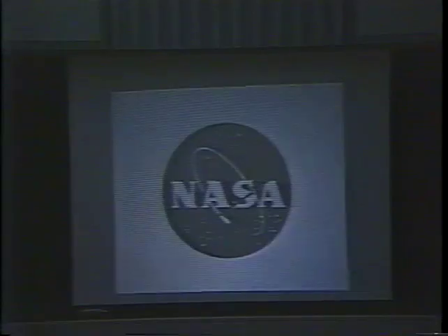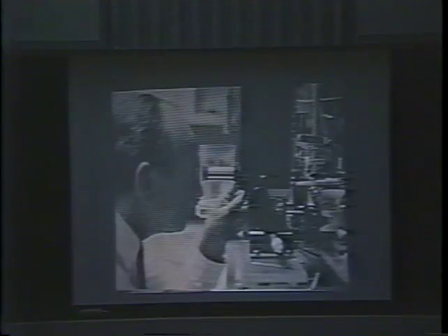From the atomic bomb project to NASA's search for life in outer space came ideas and technologies which became embodied in the cell sorter, an instrument which has automated the task of identifying and quantitatively analyzing individual cells and of separating and sorting closely related cell populations. The innovative scientists and engineers who invented this instrument successfully integrated ideas from the newly emerging technologies of lasers and computers together with new adaptations in hydrodynamics and optics in order to build a powerful tool for biomedical research and clinical medicine. The horizons for applying this new instrument are still being probed. The initial results have been exciting and rewarding.